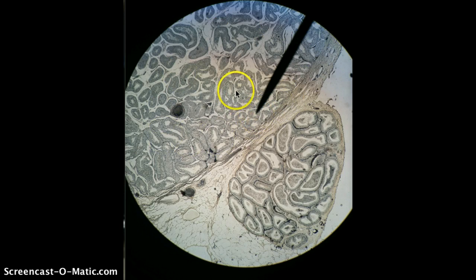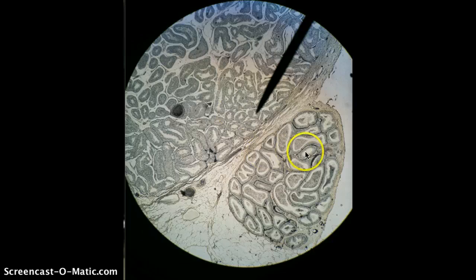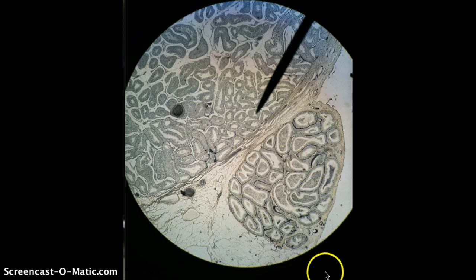What are the little triangular groupings of cells here? Interstitial cells. What do they secrete? Testosterone. What hormone causes the interstitial cells to secrete testosterone? It's luteinizing hormone, or LH. And then the organ down here, below the pointer, is the epididymis.